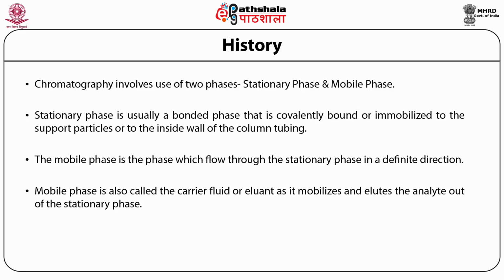In other words, the components that adhere more strongly to the adsorbent travel more slowly than those with weaker adhesion. In effect, this process separates the various components of the sample mixture into individual compounds that can be further analyzed.